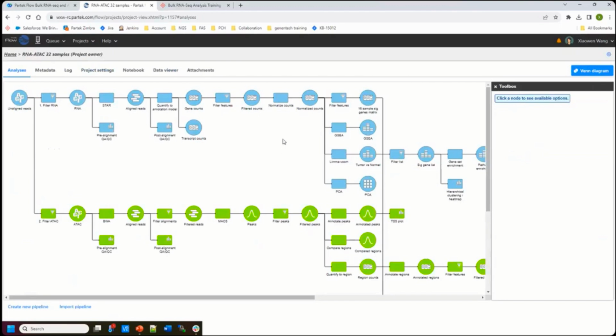So that's why I didn't use the default DE-seq. That's my reason. But you can perform different normalizations and then different downstream analyses. I don't want to make the pipeline too complicated. It's already complicated, so I just use one normalization for all the different downstream analyses.